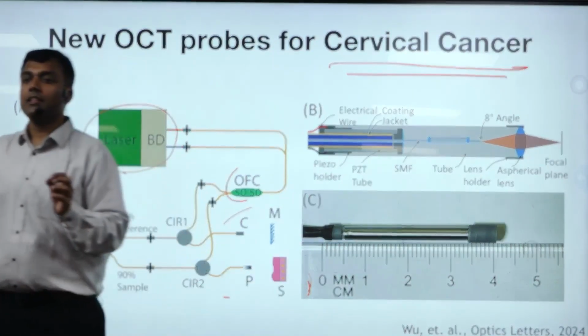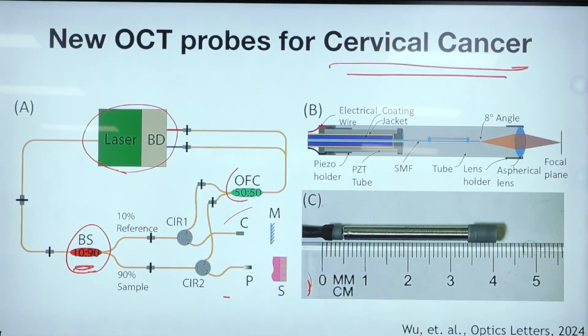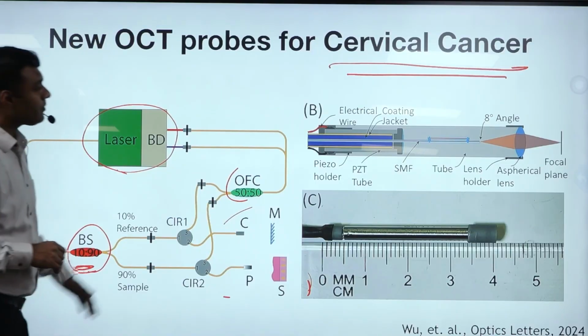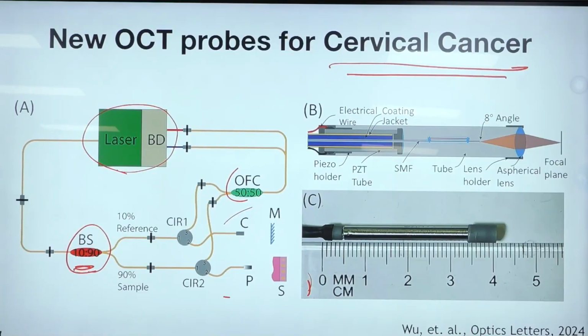So basically you can completely isolate the x-axis and y-axis and make them independent, so that you can control exactly what position you want, or what beam shape you want. If you want to scan in a specific manner, you can choose a pattern. I'll get to what patterns you can choose in a minute, but basically that's the idea.